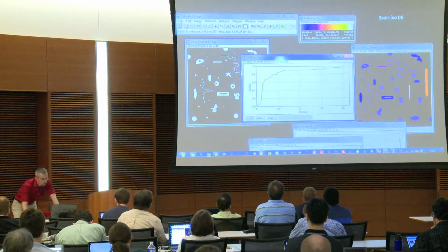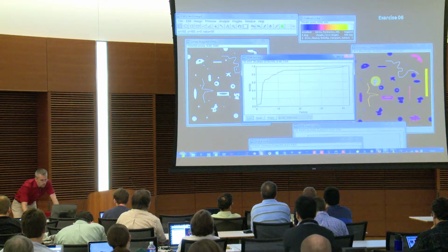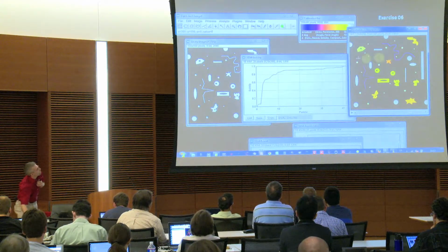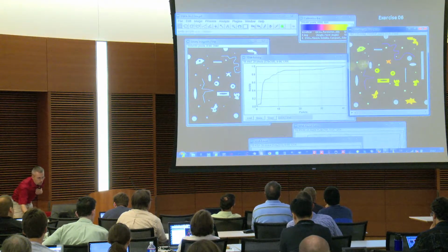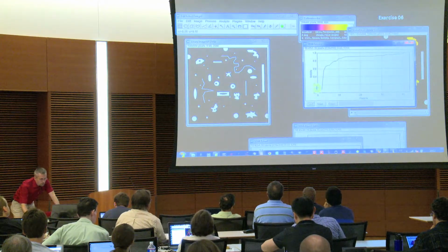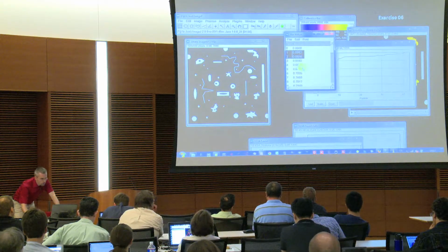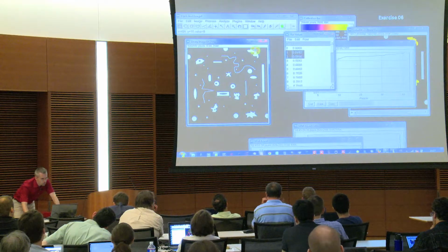Extent is the same. So for example, for the solidity, if I go in that stack to solidity, then in solidity you see, actually I don't know if you see that in front, these lines we had here are very dark, they are shown in blue. The other ones are brighter, so they have a bigger solidity. So if I go to my list, here is basically the jump which occurs. So I have here a very low solidity, and then I get higher ones. So if I stay below 0.1, I should be able to extract them.